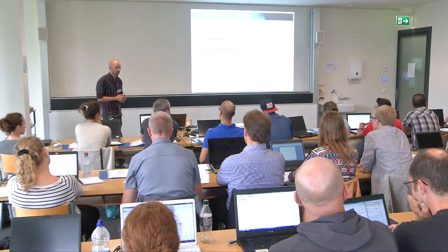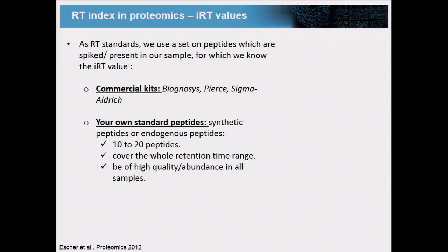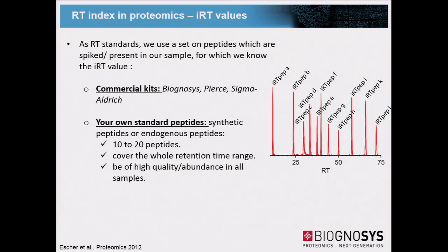Any other questions? So what we use in the lab is a kit provided by Biognosys, and I'm going to use this kit, because this is what we use and we're very familiar with, to exemplify this concept now in practice.